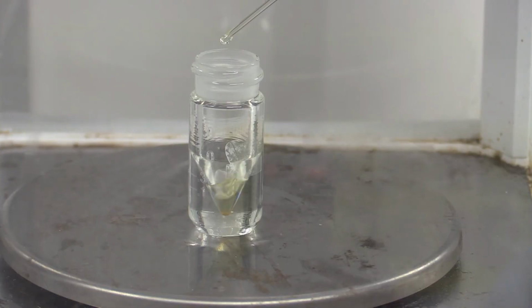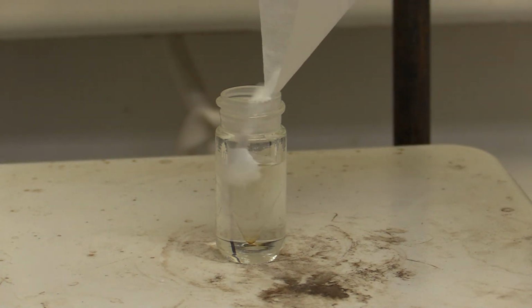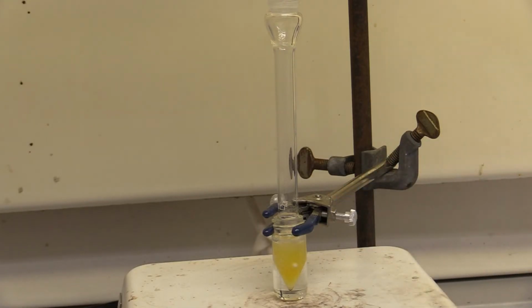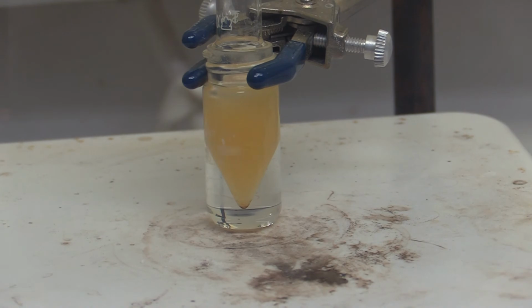Add trans-cinnamaldehyde to a 3 ml conical vial. Add dichloromethane, benzyl triphenylphosphonium chloride, and a stir bar. Add sodium hydroxide while stirring. Attach an air condenser and clamp the apparatus. Stir vigorously at room temperature for 30 minutes.